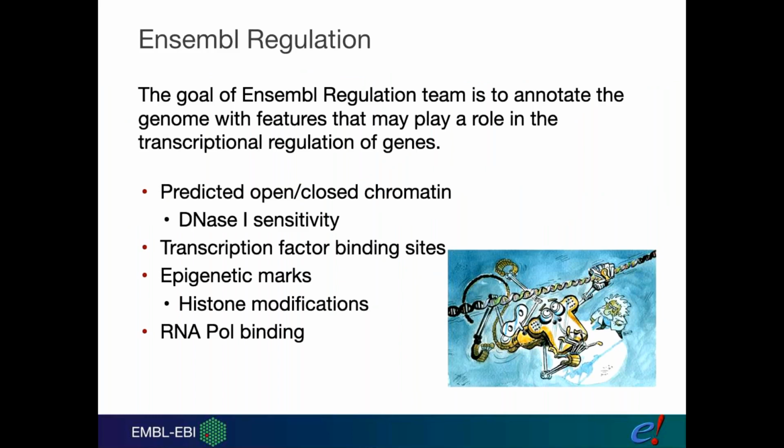So what Ensembl regulation is trying to do is go from this state of saying we've got tons and tons, and we really are talking thousands of experiments of ChIP-seq data on our histone modifications and our transcription factors, and actually going to something more simplified and saying this is where the promoter is, this is where the enhancer is, and is it active or inactive in different cell types.